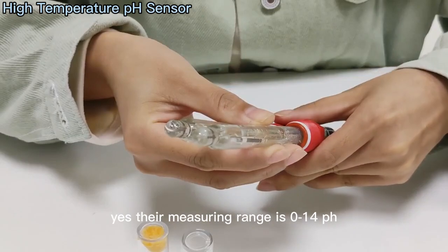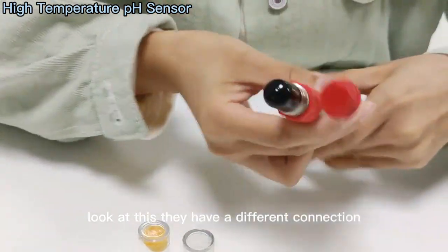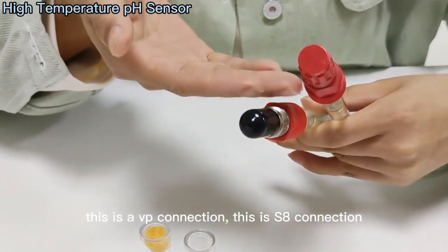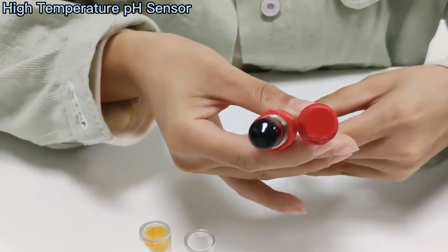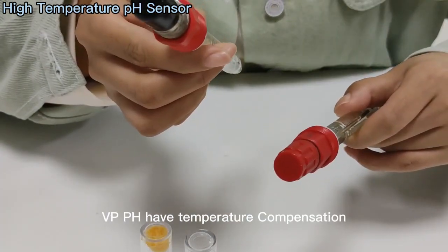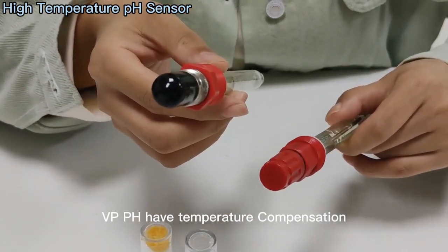The range is 0 to 14 pH. They have different connections: this is a VP connection, and this is an S8 connection. They have different connection types for pH, and they have temperature compensation.